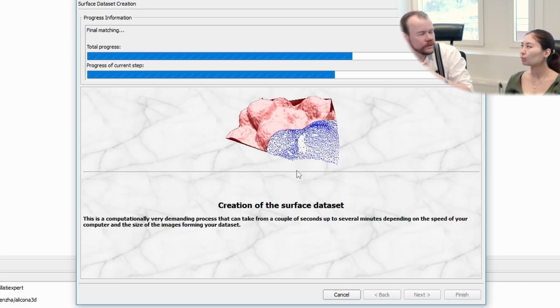So if we want to have high resolution in the 3D image, we want to scan a lot of pixels also. I have run this with 8,000 by 8,000 pixels and things like that, but then it can take like an hour to calculate. So that is a side effect of this, that you lose resolution when you calculate the 3D.